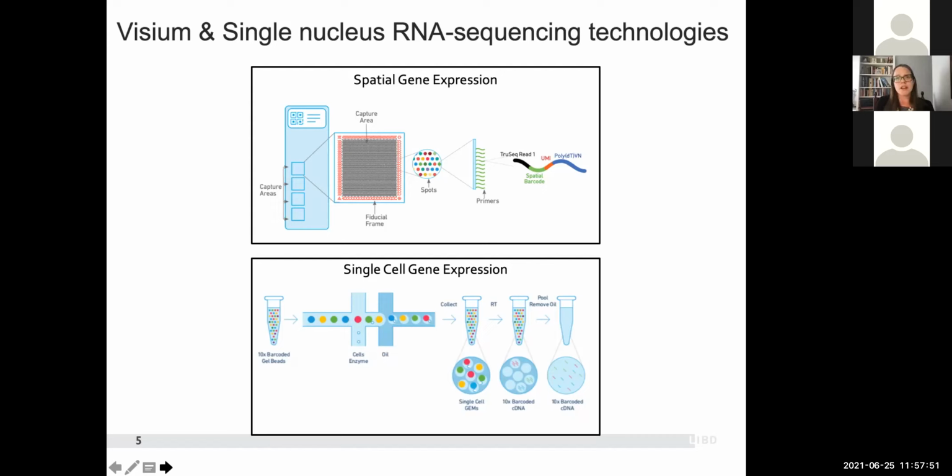We also used the 10x Genomics single-cell RNA sequencing technology to identify molecularly defined cell types in human DLPFC. This droplet-based approach uses uniquely barcoded gel beads, which are mixed with nuclei and then added to an oil surfactant solution to create single-cell gel beads in emulsion, or GEMs, which act as individual reaction vesicles in which the cDNA for that nucleus is barcoded. This takes place on a piece of equipment called the Chromium controller.